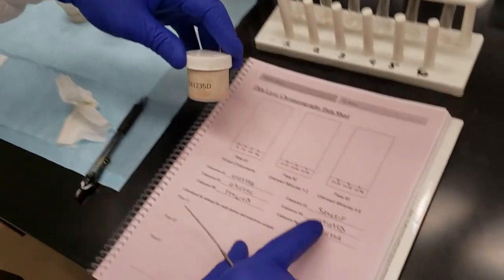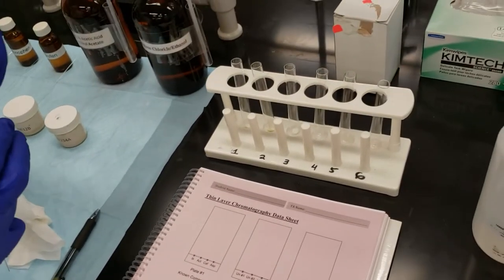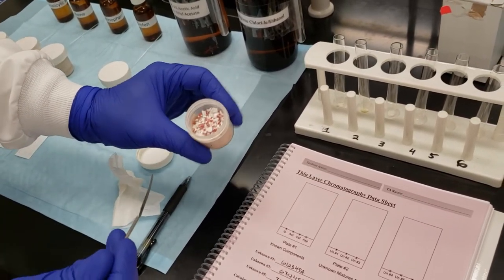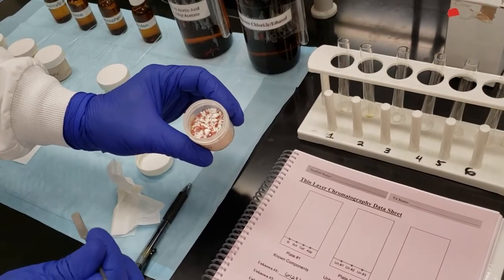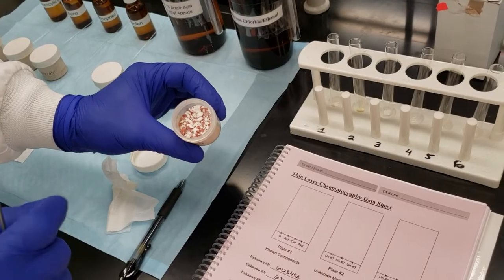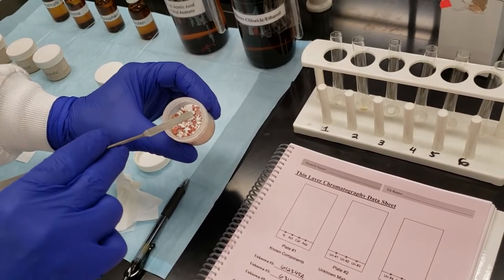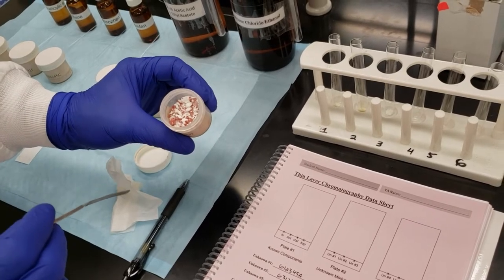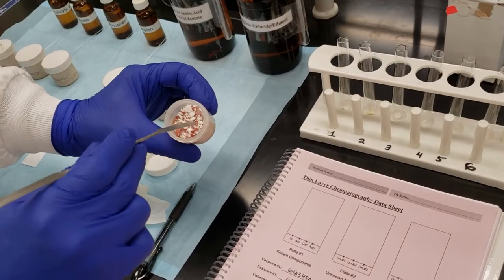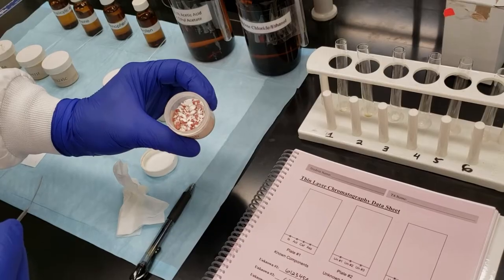On to number 4. Now take a look at this powder. We can see some maroon, reddish orange casing. That's actually the outer casing of the pill that we ground up to make this mixture. So this is part of the inactive ingredients. What we're looking at with our TLC is just the active analgesic components. But this is some of the inactive ingredients that are part of the pills and analgesic mixtures that you can buy at the store.